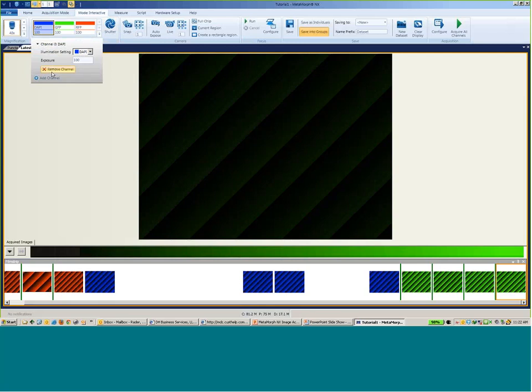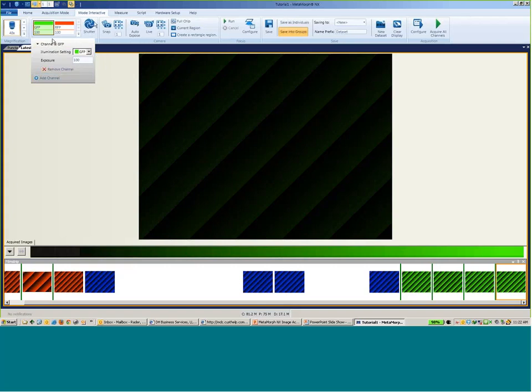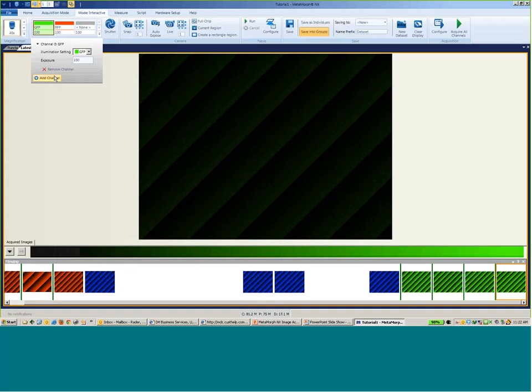Now if I add a second position, so that's my 3 wavelengths, and if I double click, I'm moving the current point. And as it's acquiring, this map will update to show you what the current stage position is. So you can see in relation to each other what the different stage positions are, so you can potentially set the list so it's much more efficient on how it's moving the stage for you.